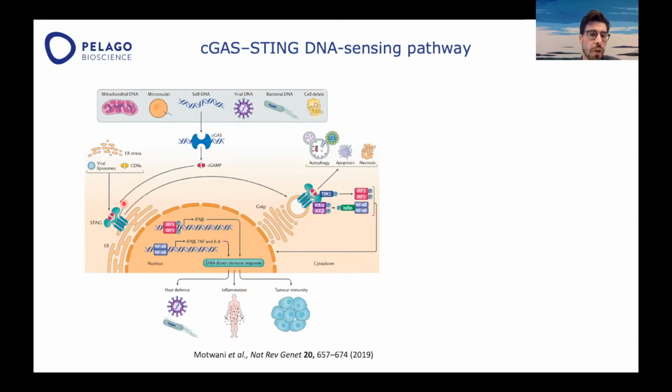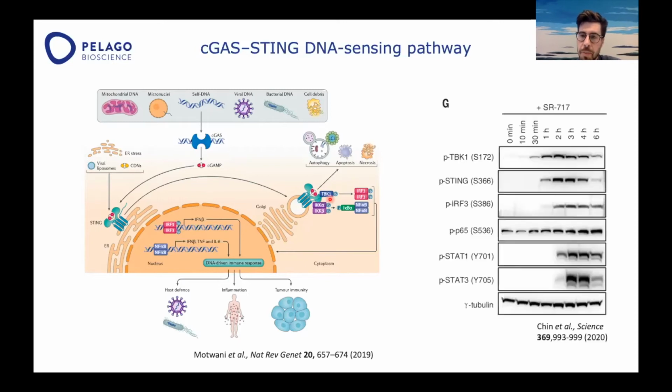So we not only wanted to observe target engagement, but also part of the downstream biology. And this is nicely exemplified in the example by Chin and colleagues here. When they profiled their compound, they could observe phospho-TBK1 after 30 minutes of compound incubation, and already after 1 hour, they could detect phosphorylated STING. So we are aiming to reproduce the same with our tool compounds.